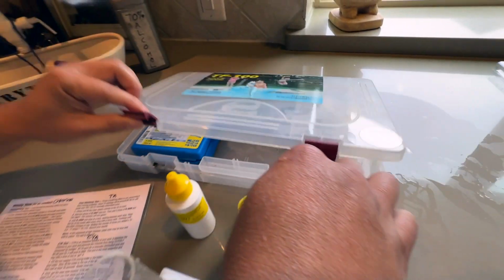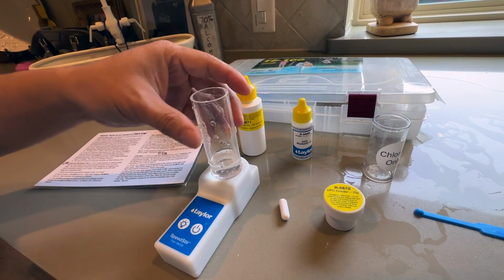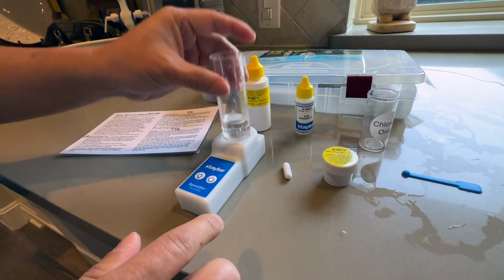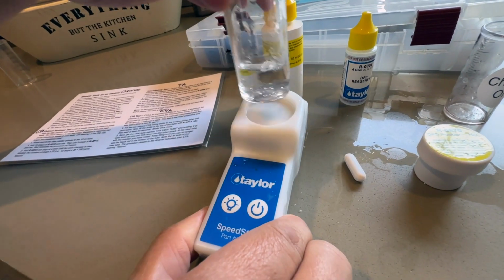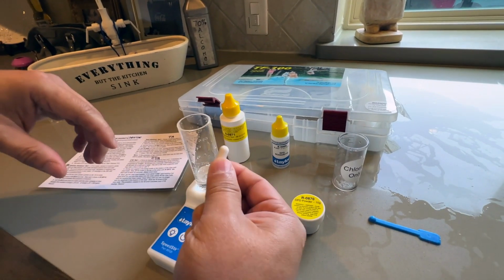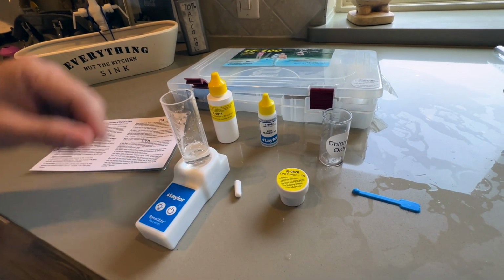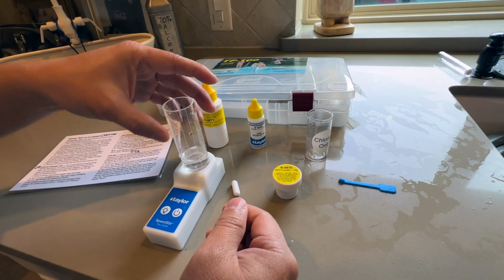All right, so let's get to measuring the chlorine. First thing you're going to do is get 10 milliliters of water into a container like this. I'm using this Taylor Speed Stir, which is very useful because it will stir the water quickly when I put this in. Magnetically, it will just spin it. If you don't have one, then you can just swirl it yourself.